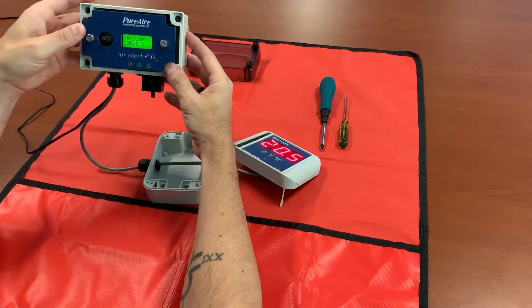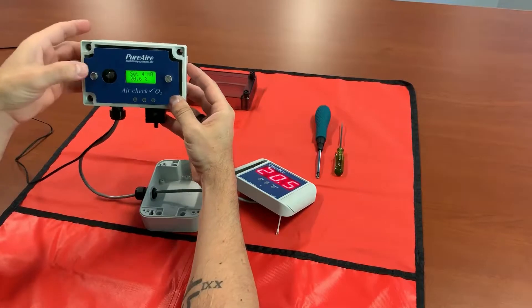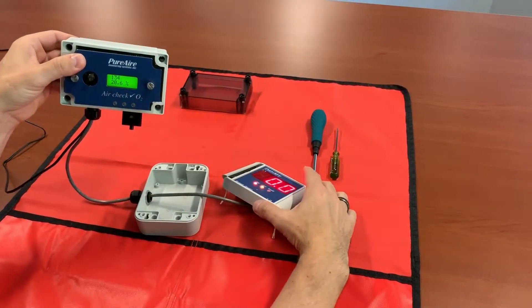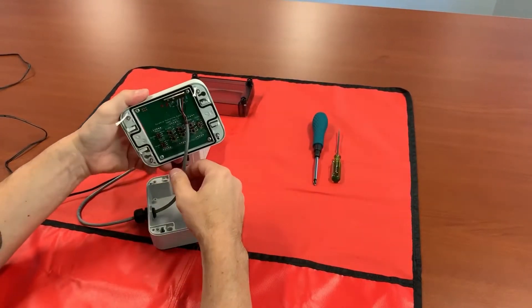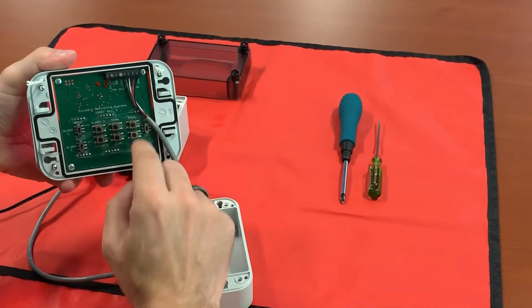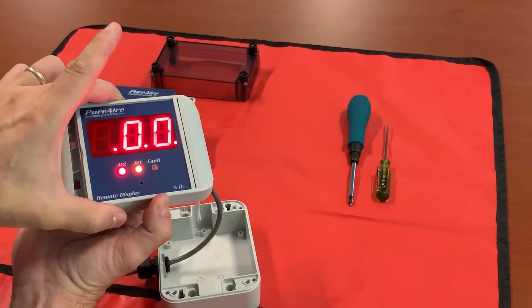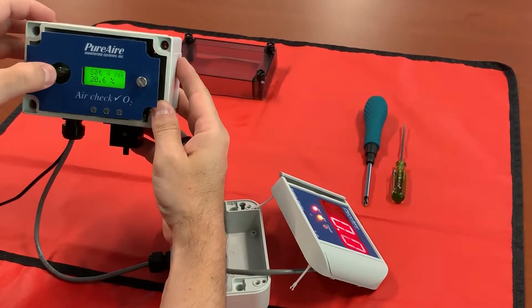Move to the right one time and now you're in your menu system, set for 20 milliamp loop. Move to the right once and now you're in your four milliamp zero. Move to the right again and you'll just see a number — you don't really have to worry about what that number is. All you need to know is that your monitor is outputting a four milliamp signal, which equals zero. On the back of your remote display you have push buttons — the ones we're working with right now are span and zero. Hold the zero button for three seconds and your remote display will flash eights then go to zero. So we've set our zero.